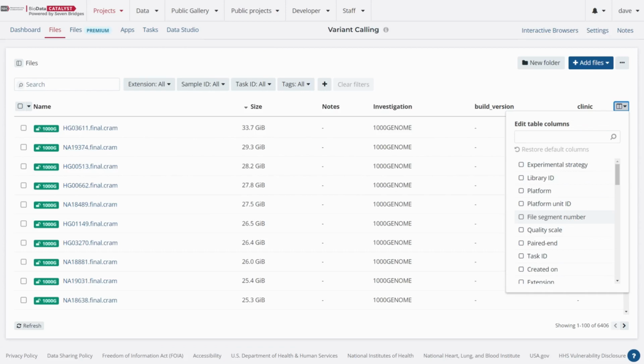So as was described before, metadata is tags and information that applies to the particular file, and it could be anything from what study it's coming from to certain types of phenotypic information, but it's really helpful for organizing your files into multiple groups. And a lot of the apps will use the metadata for the analysis. So for instance, what comes to mind is a tumor normal pair.